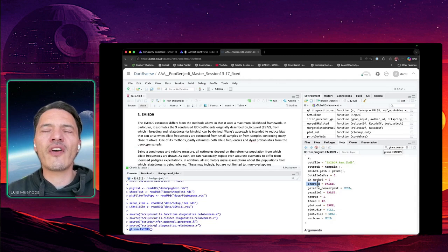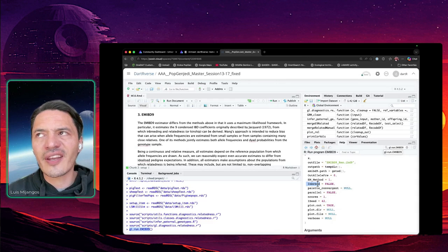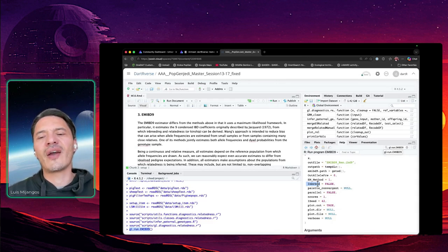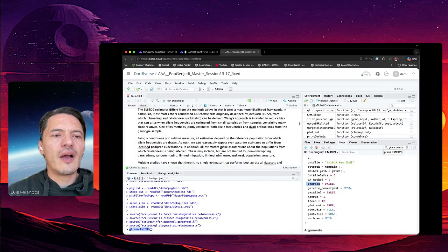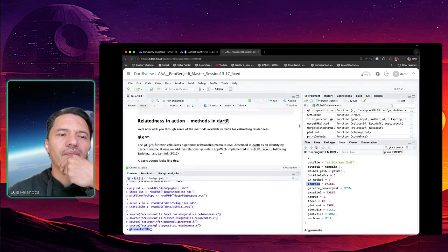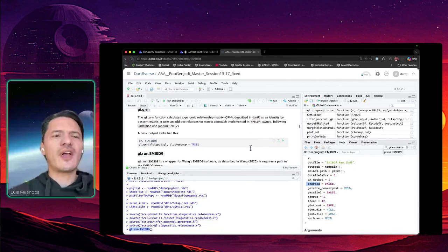So if you have problems running the parallel version with other systems, you can write to us, or email us, and we can provide those binaries if you are having problems. You can also use the gl.download.binary function to get the binary. Yes, exactly.